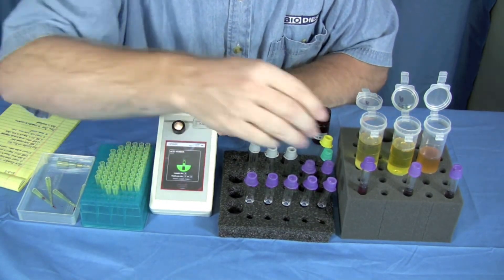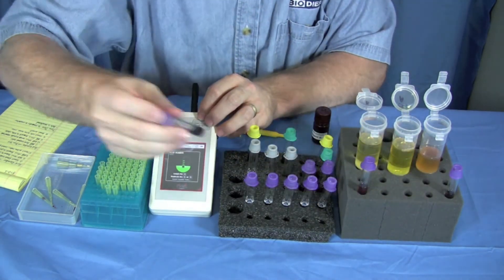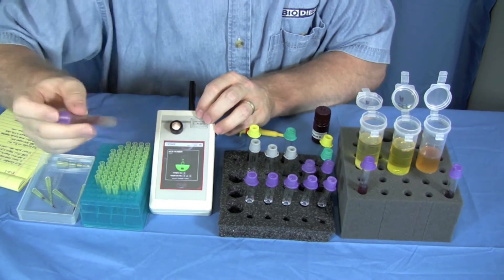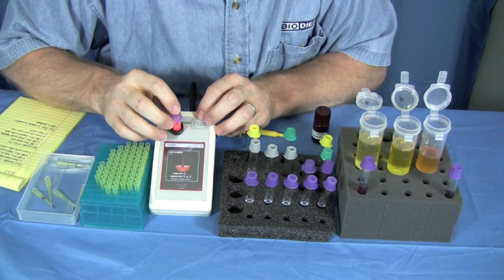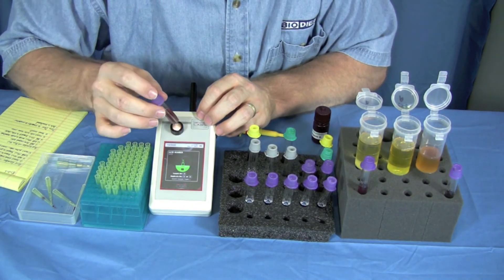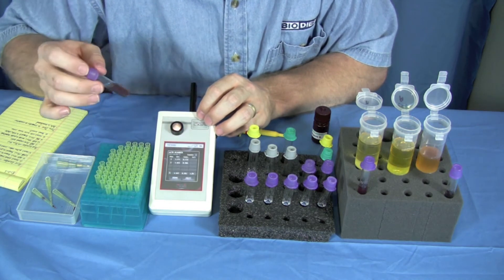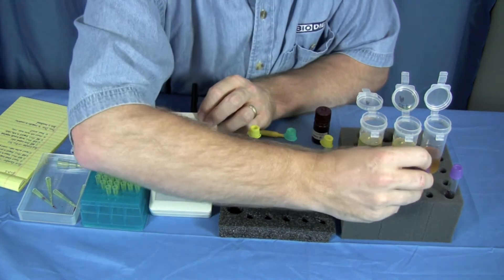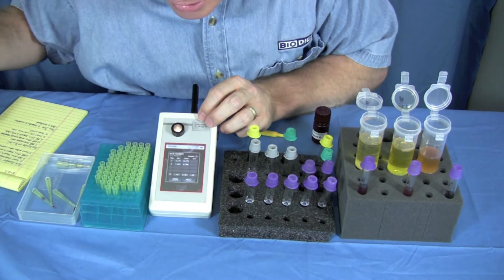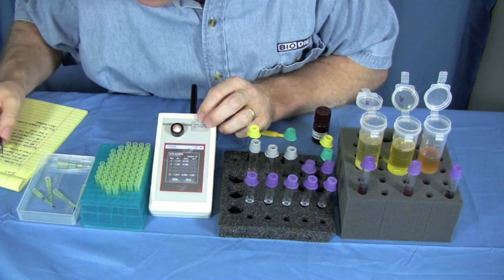To do the next one, we just grab our next test tube and shake it vigorously. Put it in, pull it out, put it in, pull it out. This one's acid number is 0.781.